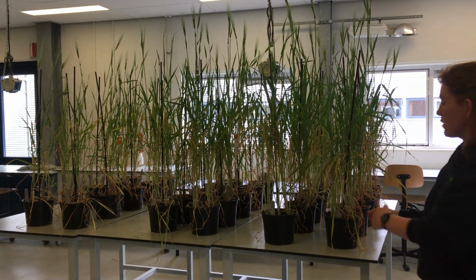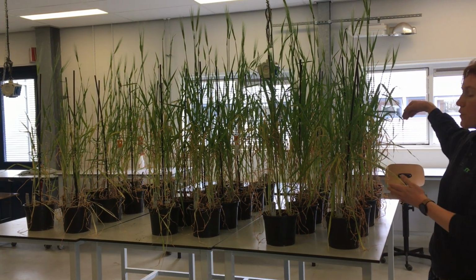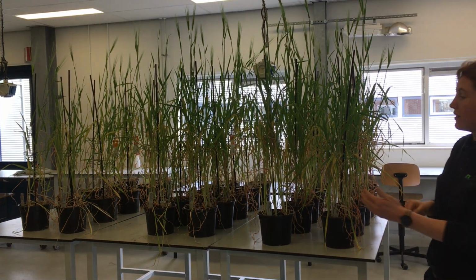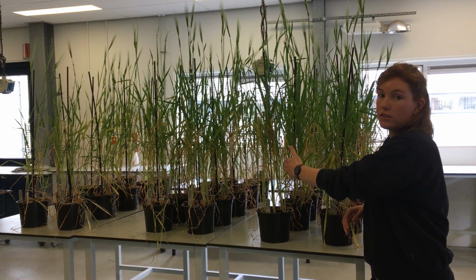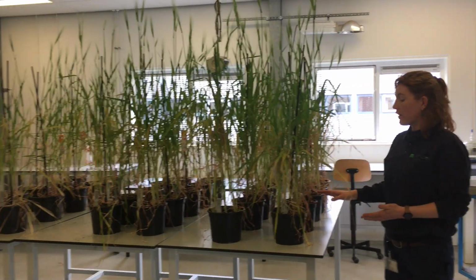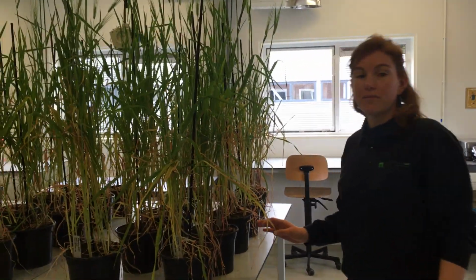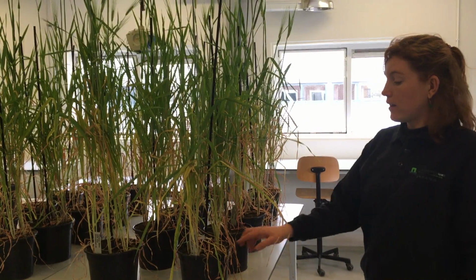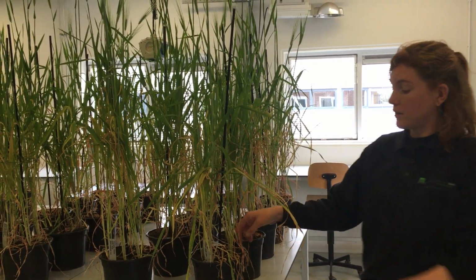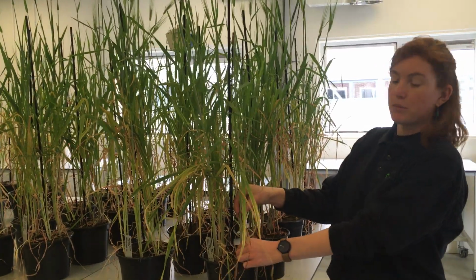And you see 2 groups that are in rich soil. Half of the plants are inoculated and the other plants are not inoculated. And in each row we have 5 different varieties of barley. And in each pot, how many plants do we have? We have 5 plants per pot, so this is 1 plant. Yeah, there are 2 stems, but it's 1 plant.